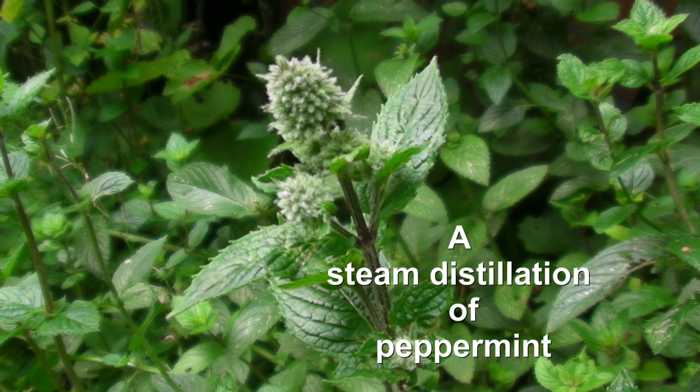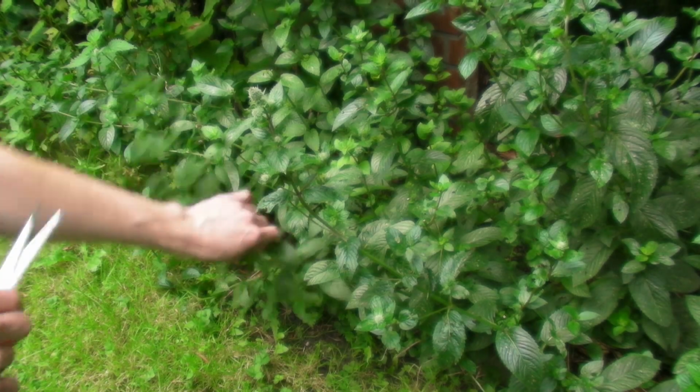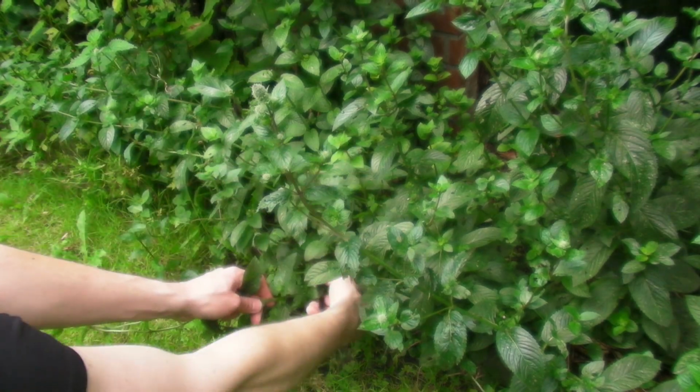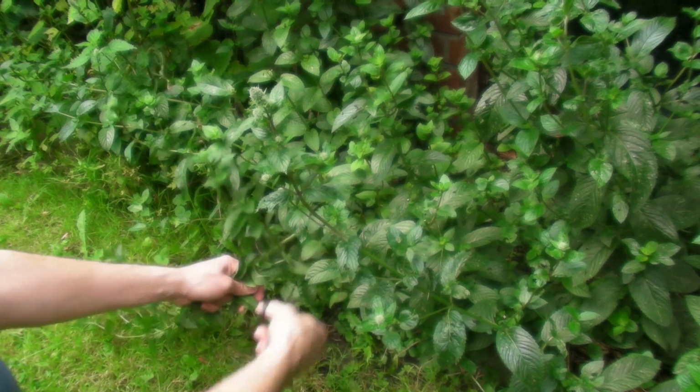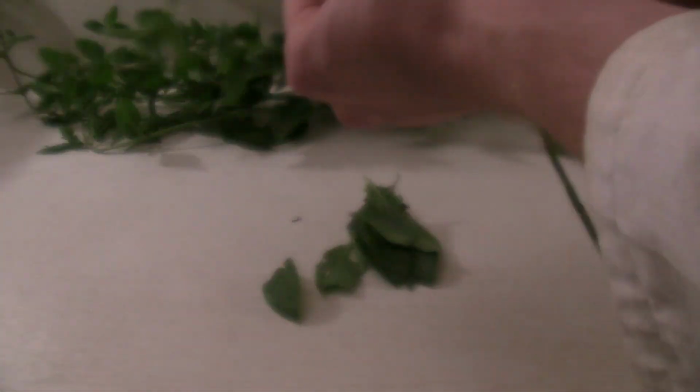A steam distillation of peppermint. First, a decent amount of peppermint was picked. The best time would be right before the flowering season. Then the leaves were separated from the stems, because these have the highest content of oil.